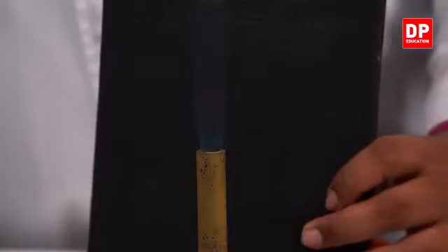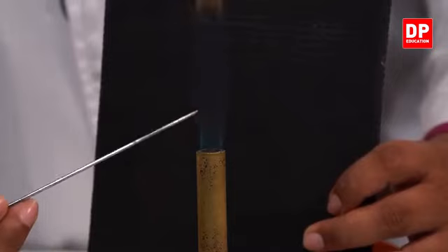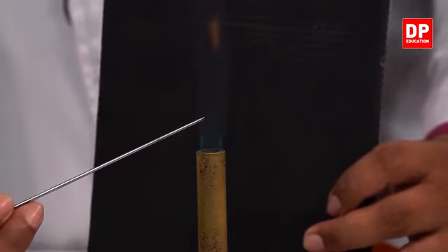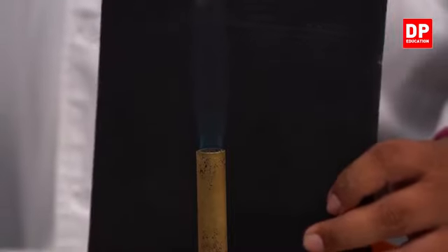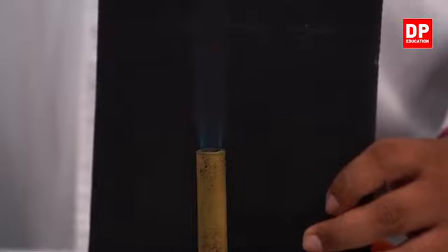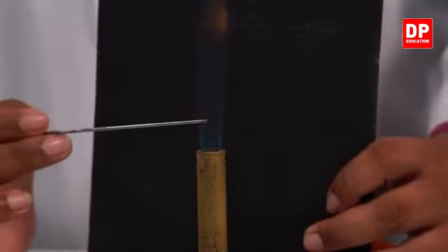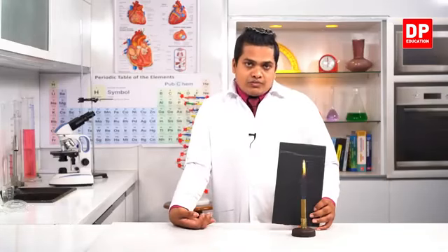Then after this light blue area and the darker blue area, in between those two, like in here, you can observe the non-luminous zone. It's not luminous to us. Actually, it's invisible. Sort of an invisible area can be observed in here, right? In this area. So that is the non-luminous zone.